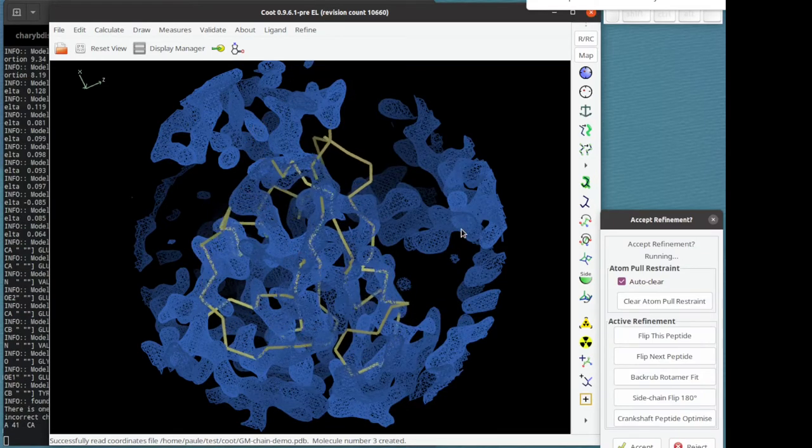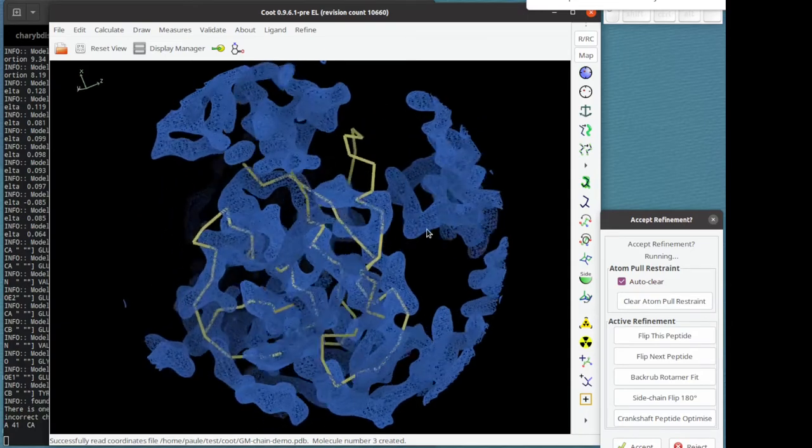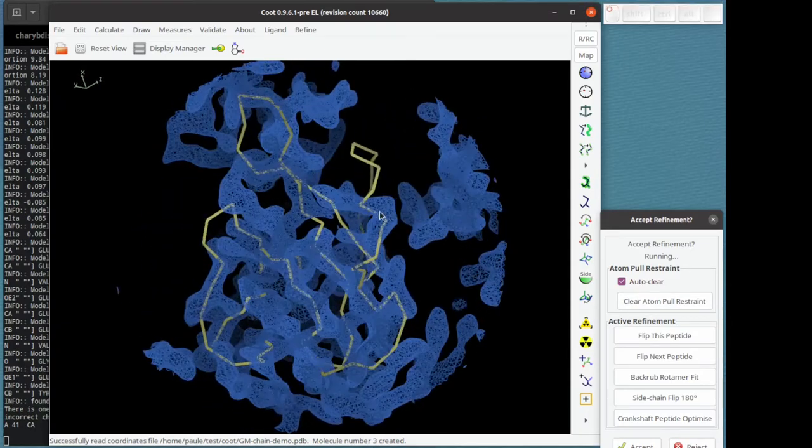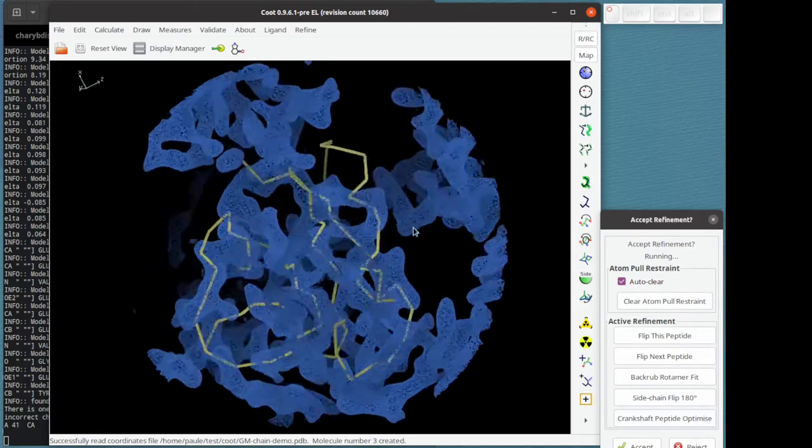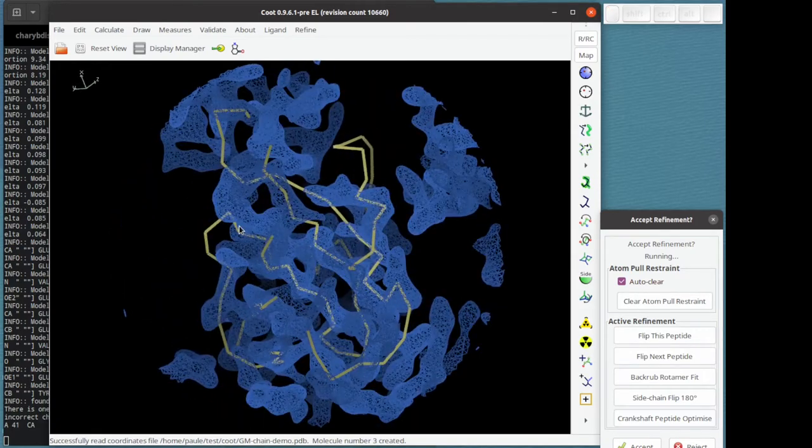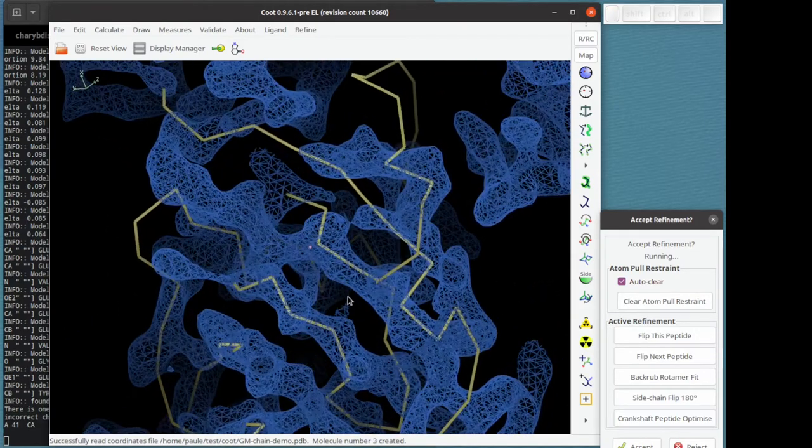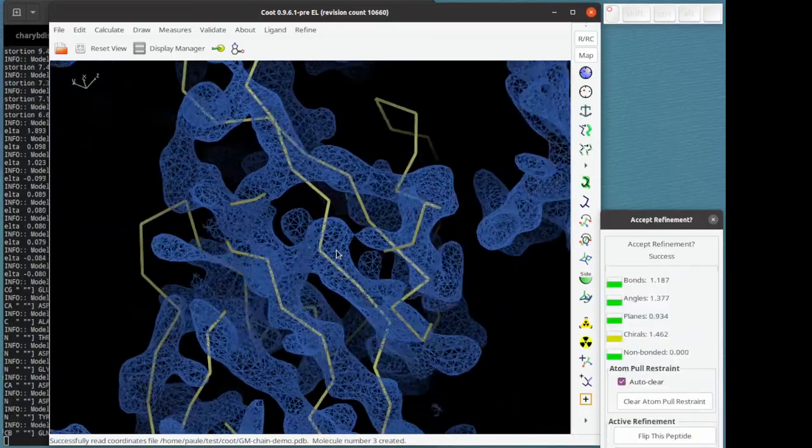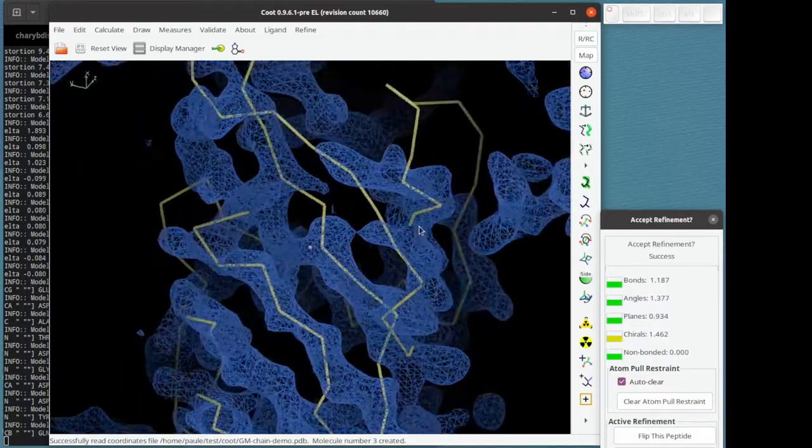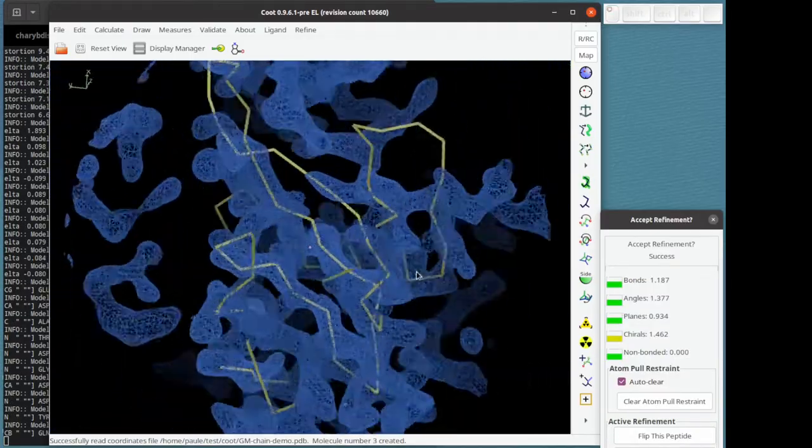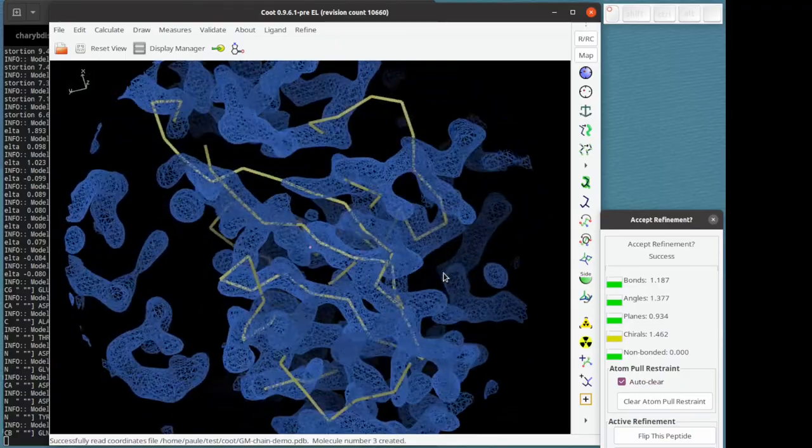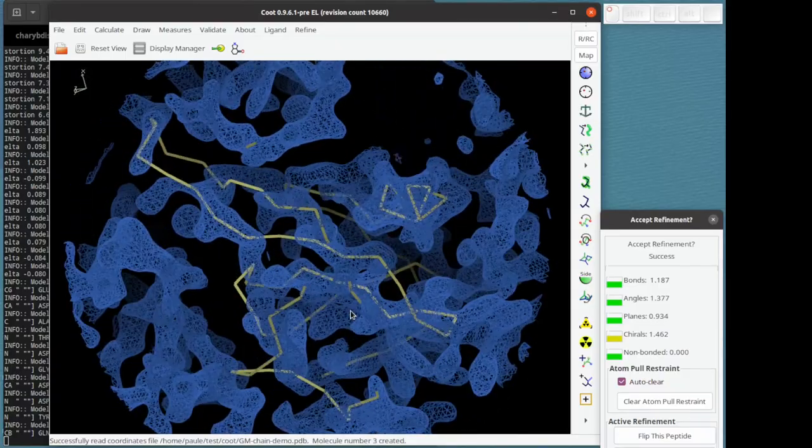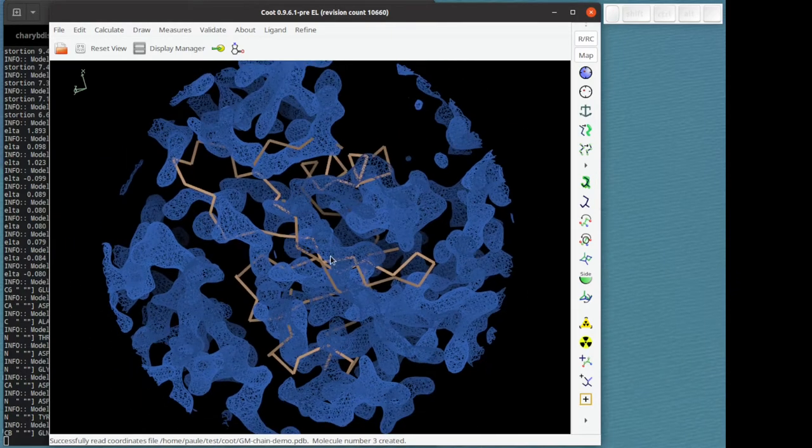You can see it distorting and morphing, going into the local minimum but not really moving around the molecule. You can see that the strands of the model have gone into the strands of the map, but generally speaking it's not a good fit overall. I'm going to redo that.